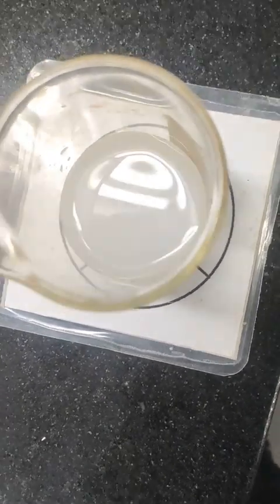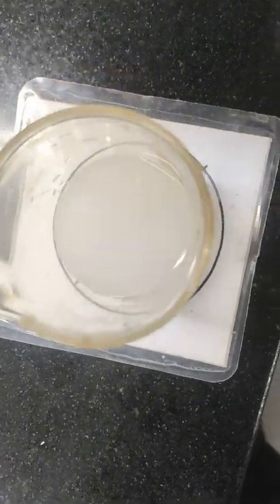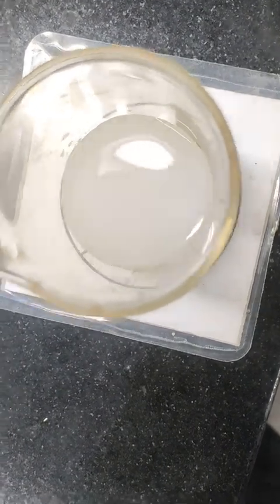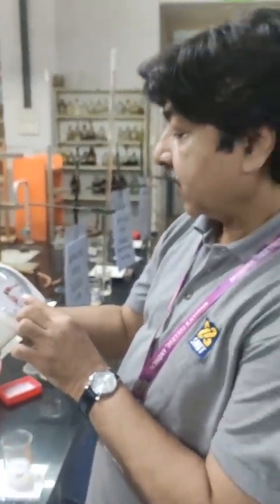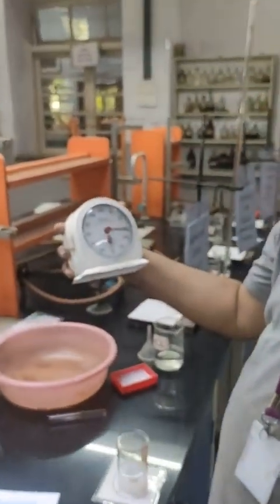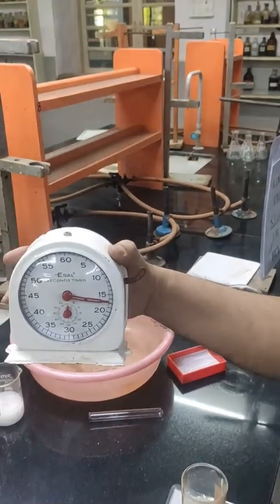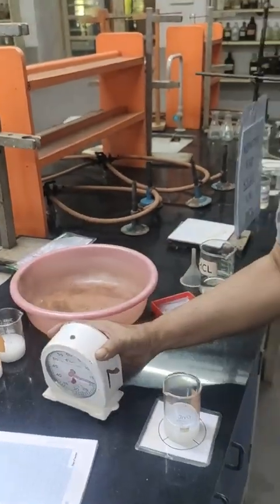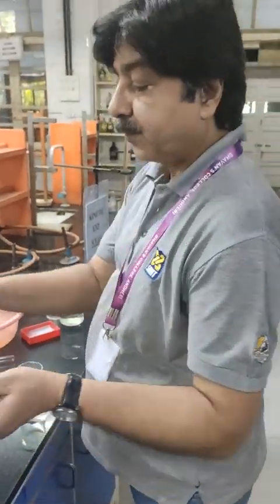You can see the mark has become invisible now. I will stop this stopwatch and I will record the reading. So the reading is 1 minute and 16 seconds.